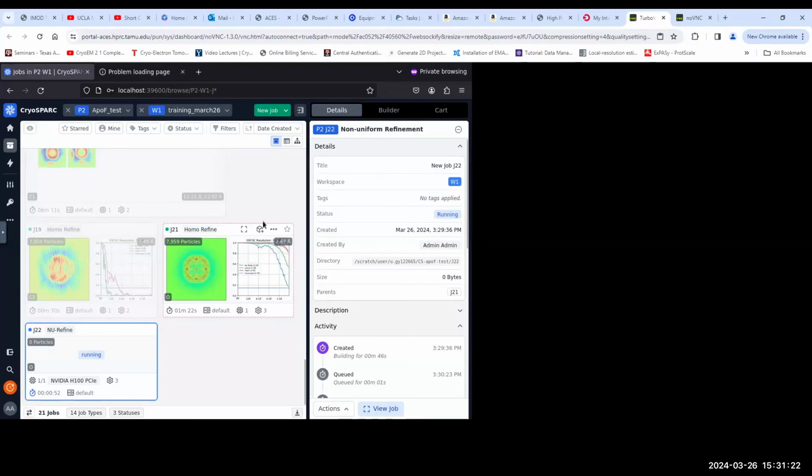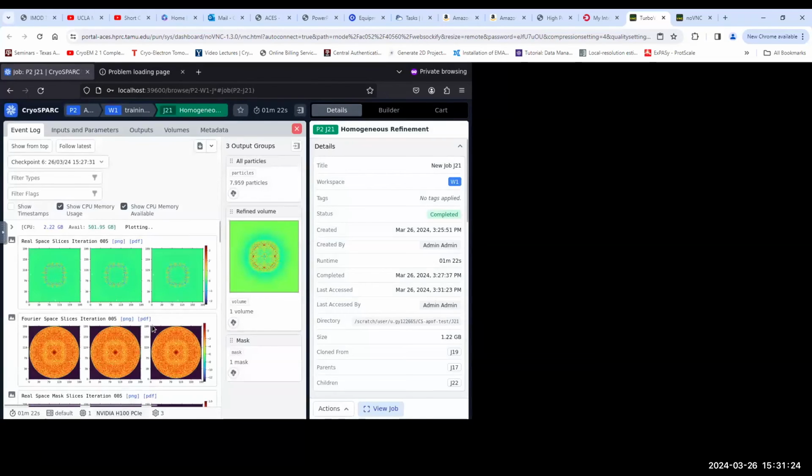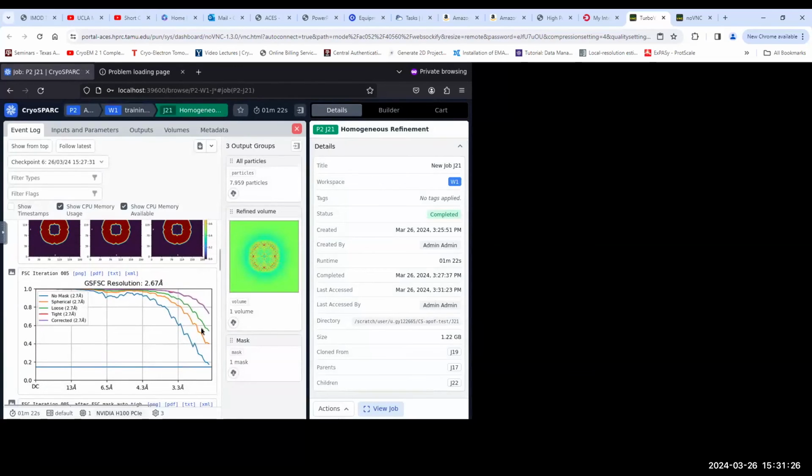So that's why you see here in our FSC, the limit for the FSC cutoff is 2 times the pixel size. Here, our pixel size is 1.2 something, so the 2.6 resolution is to, and the cutoff is around 2.5, 2.45 or something in that range. That's why you see that it doesn't go all the way down.